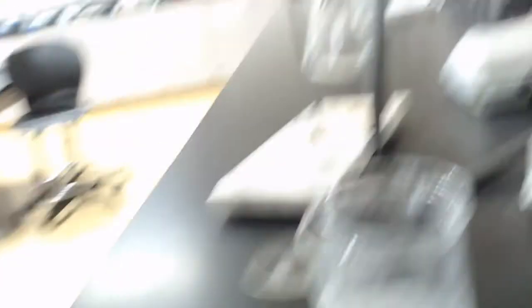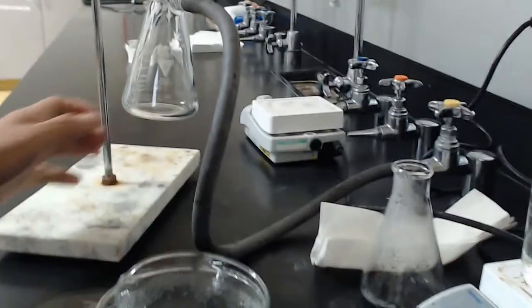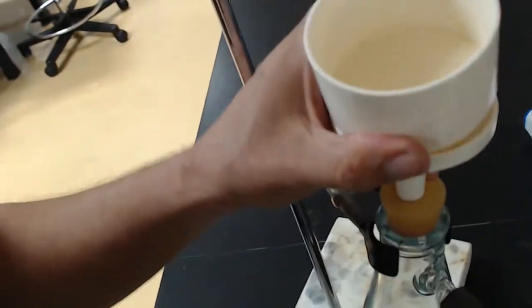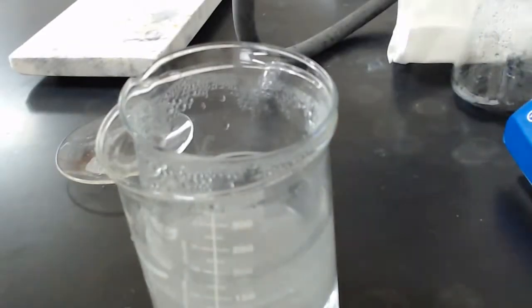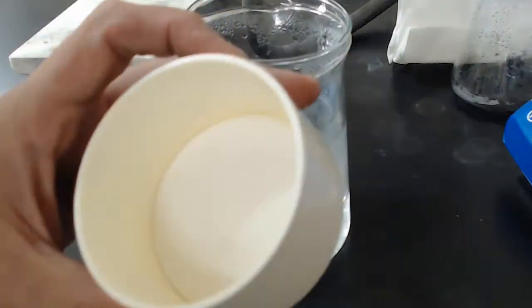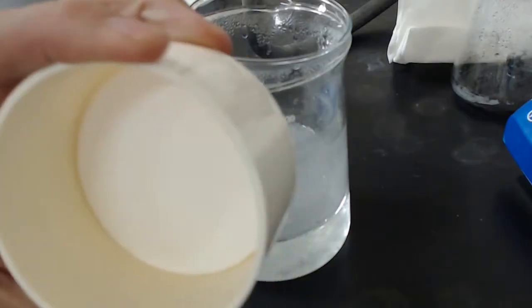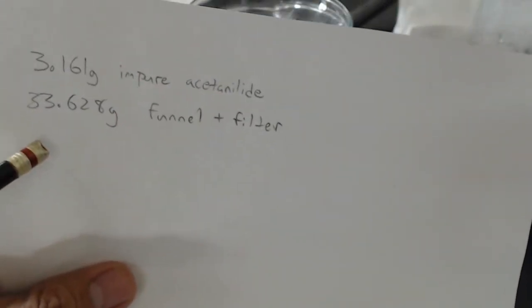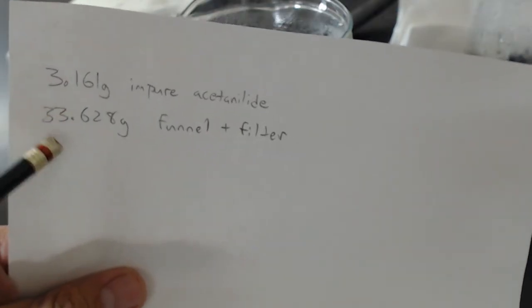And while we wait, I'm just setting up a vacuum filtration. You guys should have learned how to do this in general chemistry. I got this up to the vacuum line there, and then we have a sidearm flask, Buchner funnel. I recommend that you guys get a tare weight on the cup, as well as some paper in it. Alright, we are almost ready to get started here. I just got a tare weight on the cup and the filter paper in it. We will get the mass of the acetanilide after the filtration after it dries. The tare weight was 33.628, so you are going to need that number later. Both of them actually.